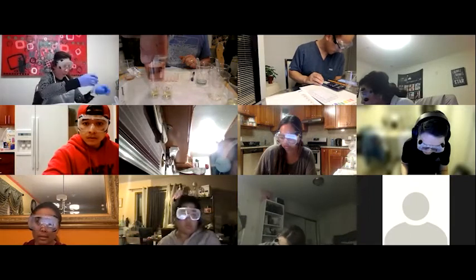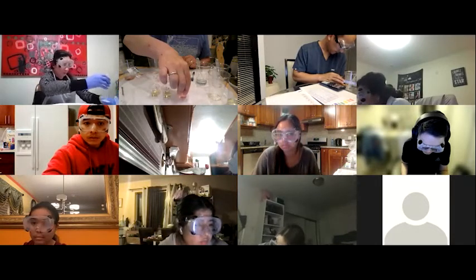I just love the colors. And you can see as soon as I added the 4.7 buffer to it, it turned from yellow right back to pink again. So I just swirl it a little bit, make sure it's nice and mixed.